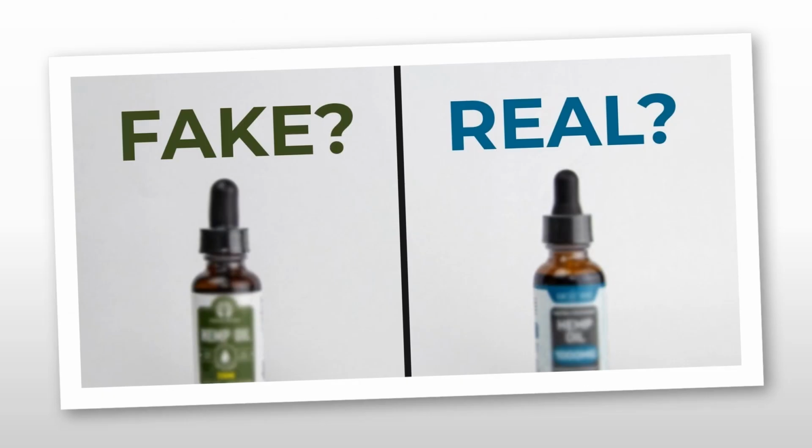The main purpose of this project is that CBD is not yet regulated by the FDA, and because of that, there are concerns that some of these hemp oils may not have the levels of CBD they claim to contain. Therefore, I hypothesized that there would be a difference in the amount of cannabinoids in the hemp oil versus what's claimed by the label.